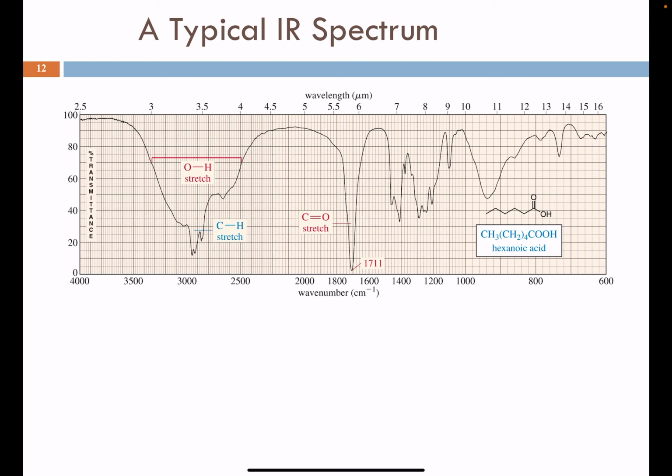Okay, so here's an example spectrum for a very small molecule, fairly simple. We can see here we've got a carboxylic acid functional group at one end. There is a chain of 6 carbons with internalized methylenes, CH2, 4 of those, and a terminal methyl. So that is hexanoic acid, with one of the 6 carbons being on the carboxylic acid. Drawing of the molecule is here.